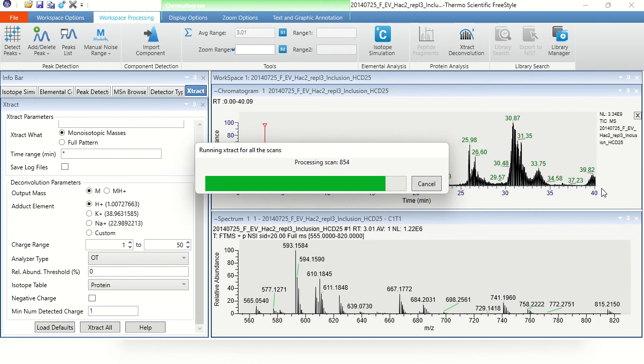Okay. One of the questions that I want to mention here is one that I find a little bedeviling as I try to work through inclusion experiments. If you recall, when we pulled out the instrument method using a Thermo raw metadump from this raw file, we saw two sets of two mass to charge values. And they had slightly different configurations, I think, on how they were to be fragmented.